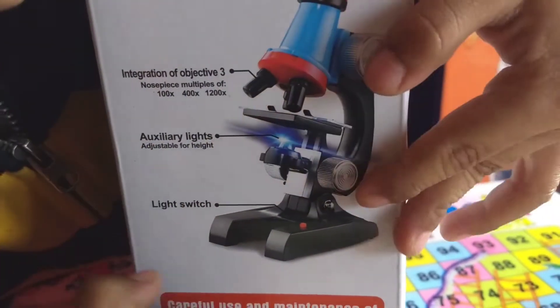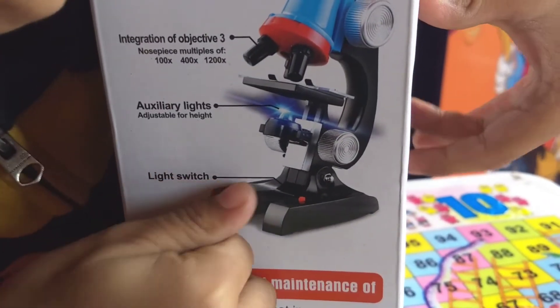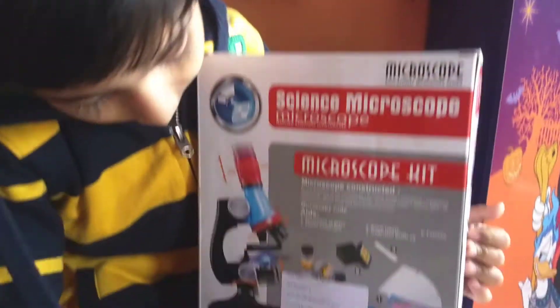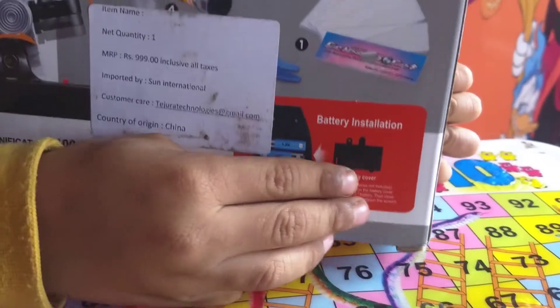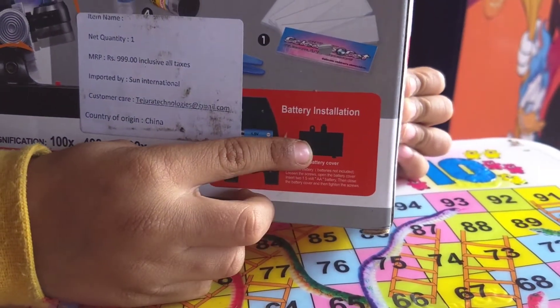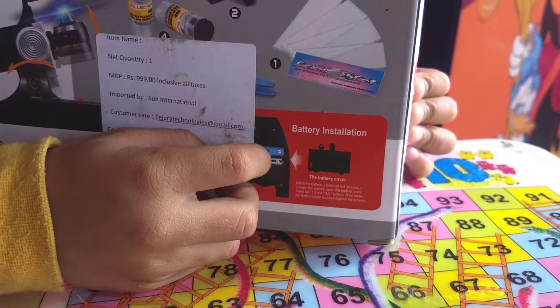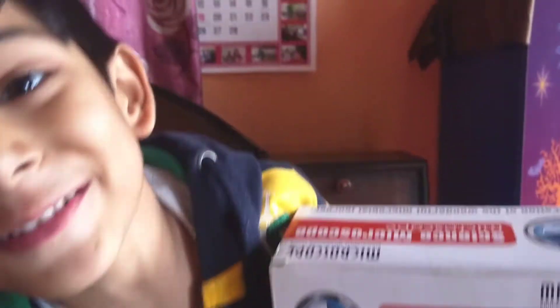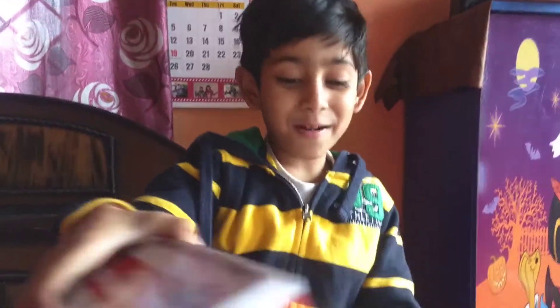See the name here. And this is the button to turn it on and off. And this is the place to put the batteries — two AA batteries here. Now I will show you the real microscope.